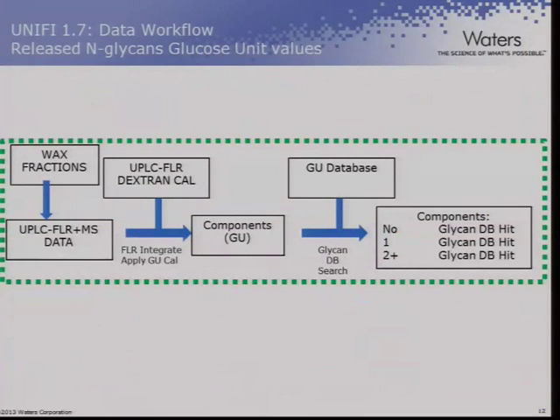And so this would be the workflow that we use, but this is also part of the Waters workflow, because we work with Waters to make a workflow that would be implementable in labs that are regulated, and to have a lot of inbuilt computing to make this easier. But you don't need that. You can do it all manually, just like we've always done.